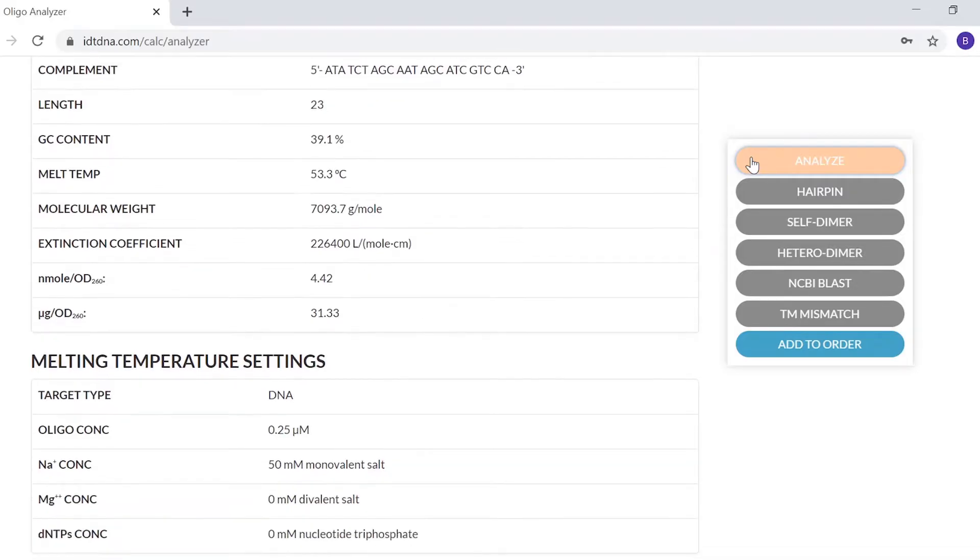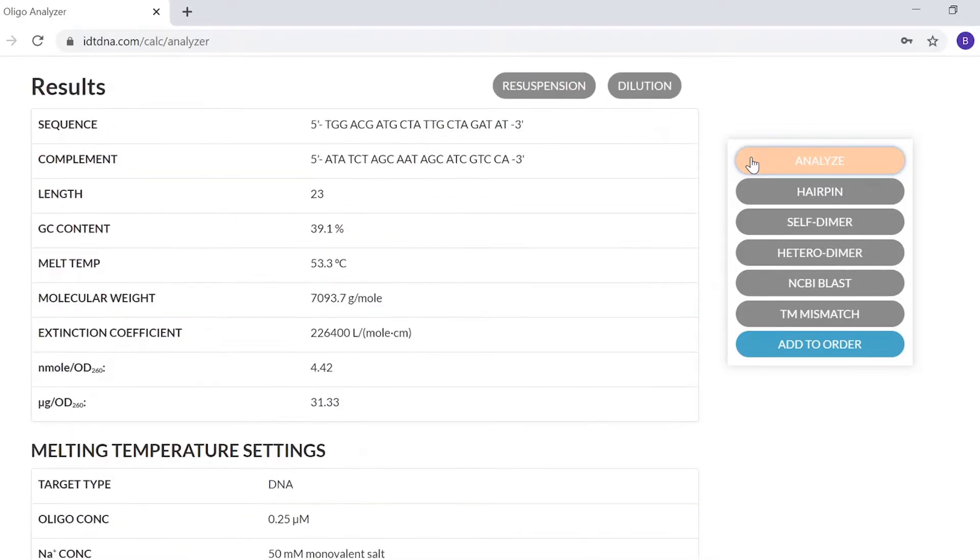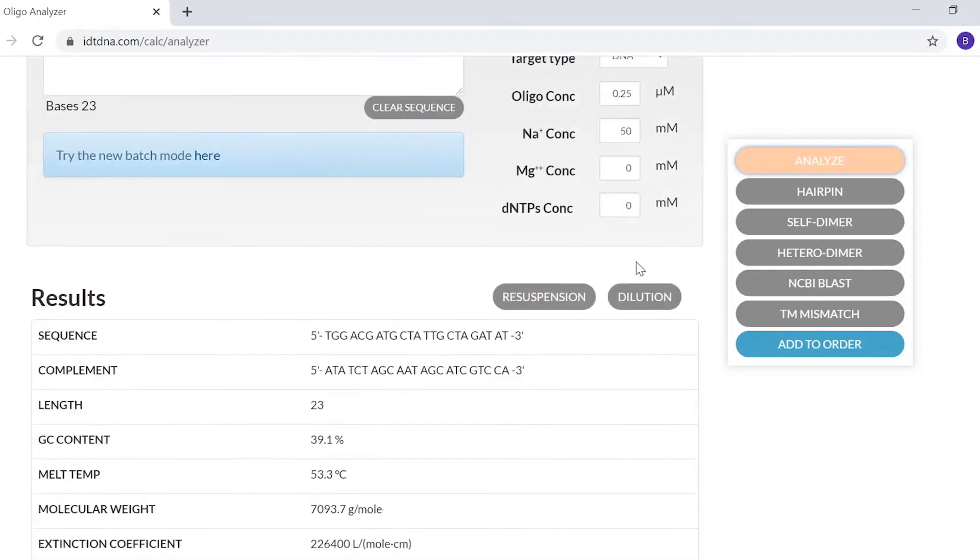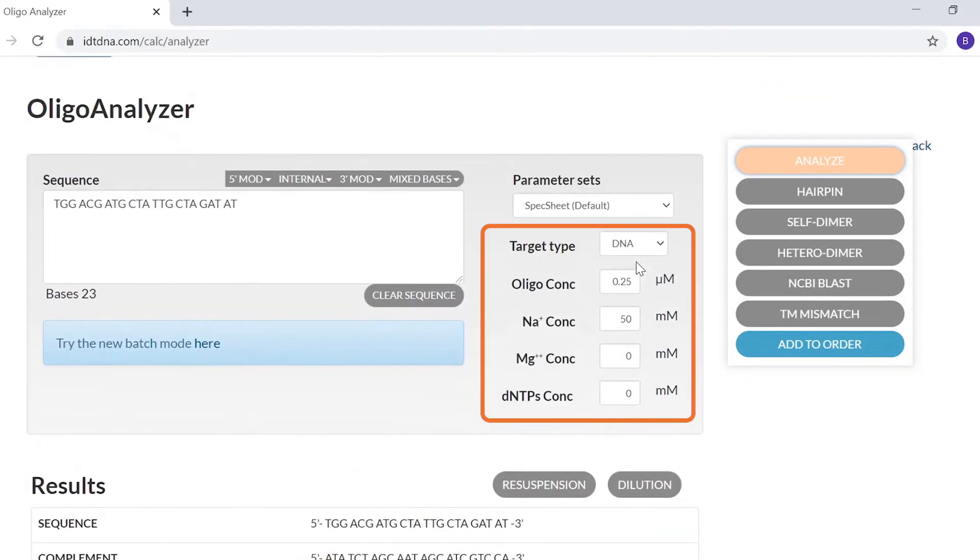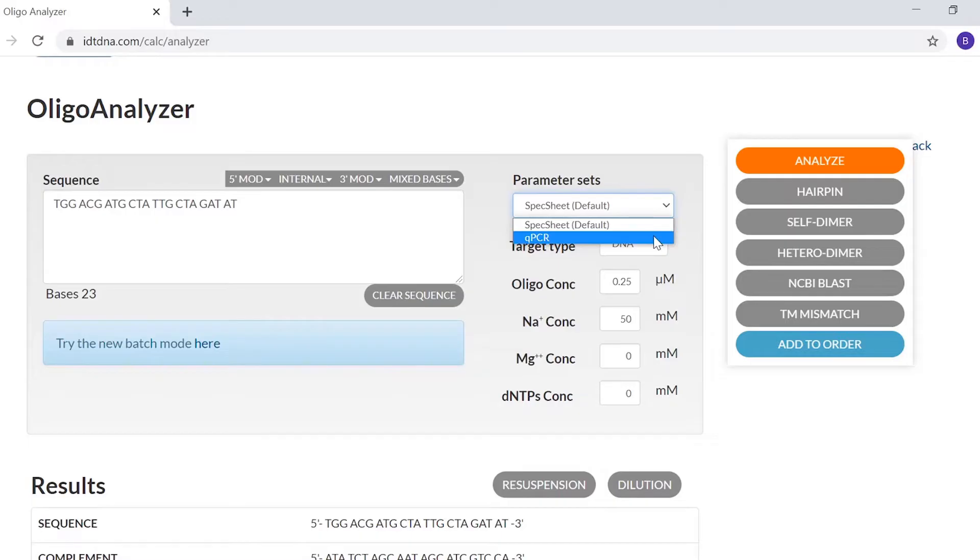The melting temperature of the Oligoanalyzer will vary depending on parameters shown on the initial screen. For the most accurate melting temperature, use your specific reaction conditions. If you're doing PCR or qPCR, you can also use the qPCR parameter set. The default specification sheet conditions may not accurately reflect your experimental conditions.